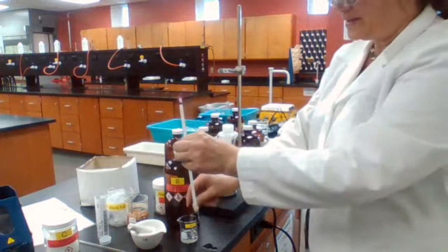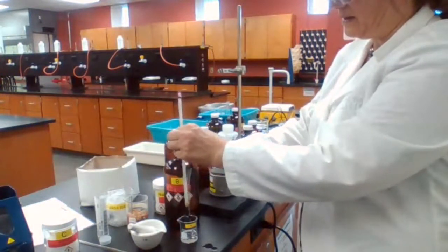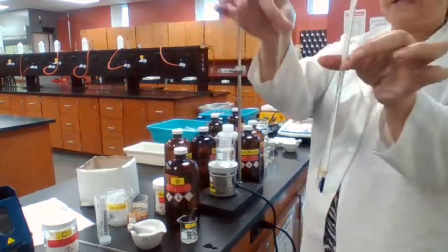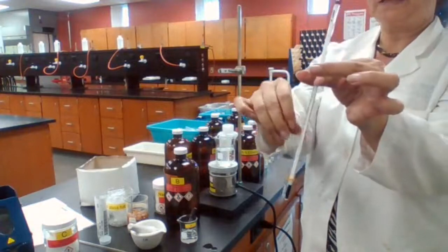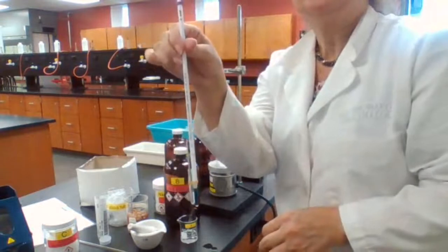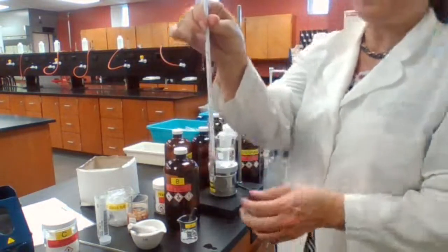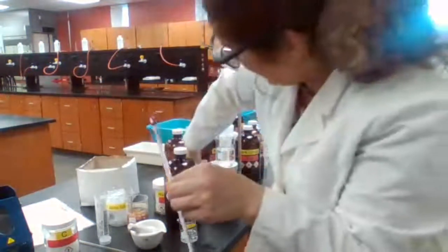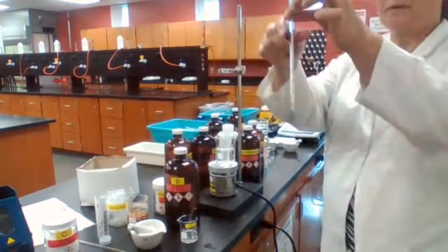This compound, whatever it is, has a very low boiling point because it doesn't stay even in the dropper. We place the capillary tube with open end down like this. The unknown is B for section B. Yes, for section B, the unknown is B. I place the capillary tube with open end down, and I'm going to start heating up the sample.